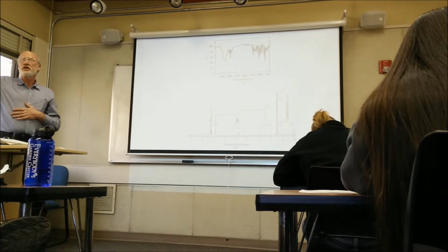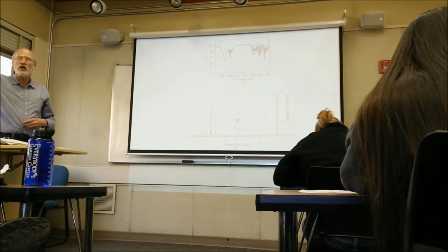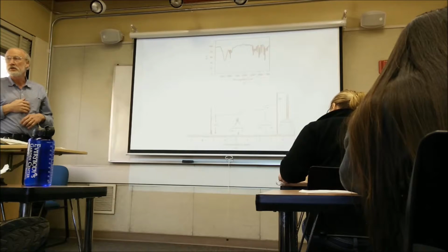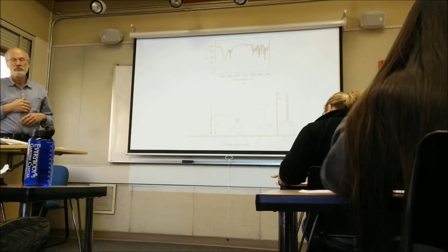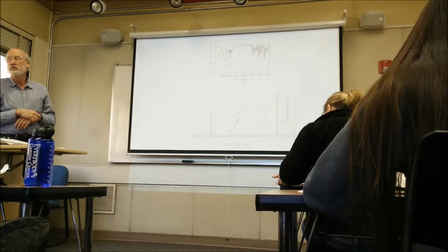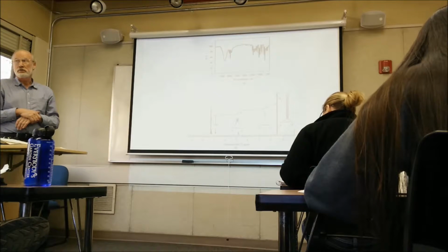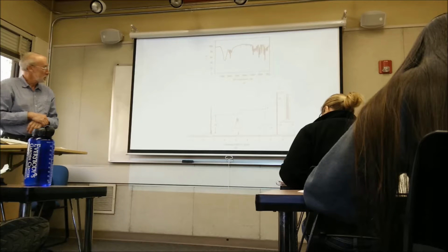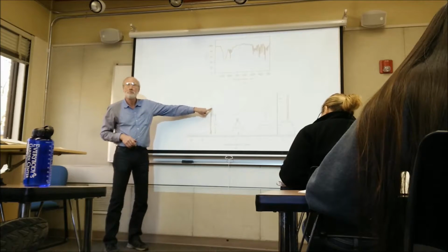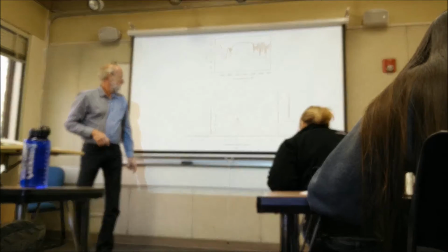Well, but now look at the hydrogens, look on your list and see where the hydrogens on a benzene ring are. What's their chemical shift? 7.2. Yeah, on the NMR, hydrogens attached directly to the ring. Right, that's what those are right there. And I would say that's pretty close to 7.2. And why are there 20 of them? There aren't 20 of them. That's just the integration.